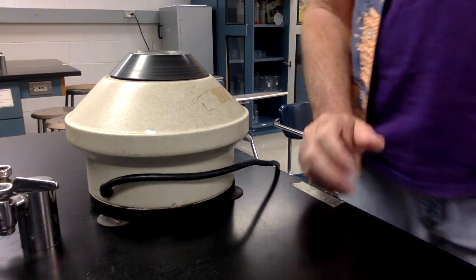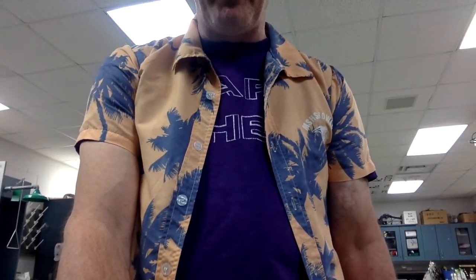Seems to be centrifuging pretty well. I'm going to stop the video right here because you don't need to watch it centrifuge for 5 minutes.